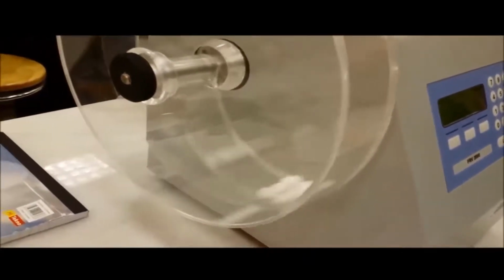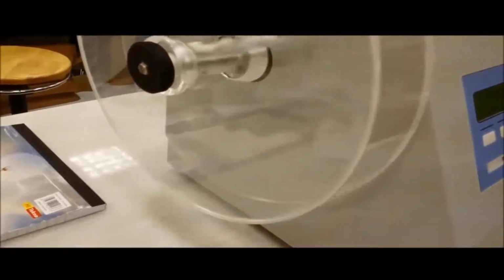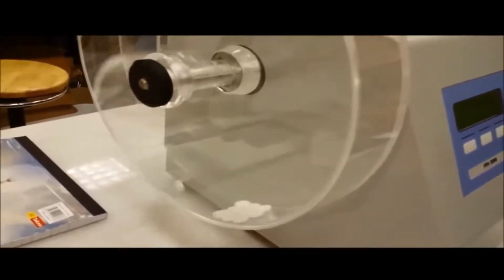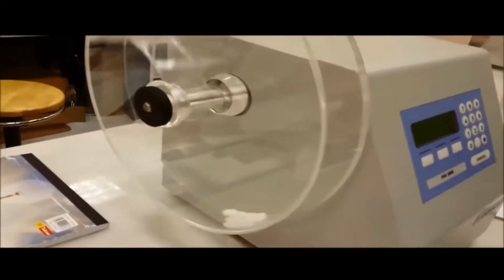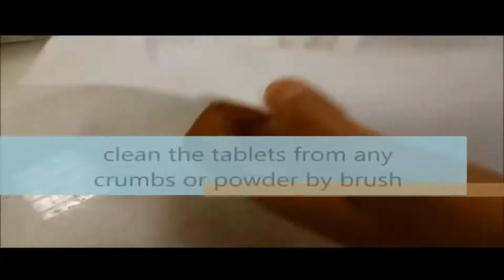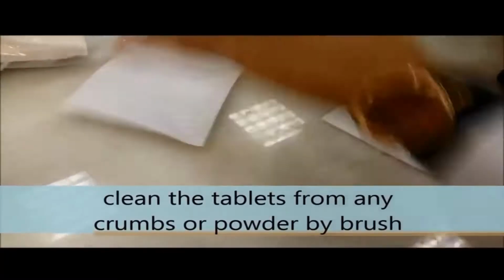Initial is when we have taken the sample, final is after running the test apparatus. After finding the difference, one can easily calculate how much weight can be lost during transportation and during storage conditions.